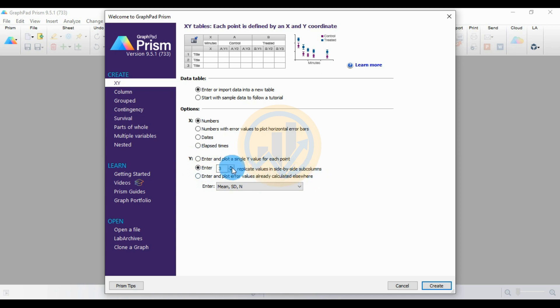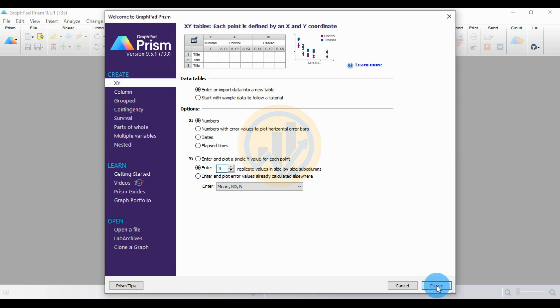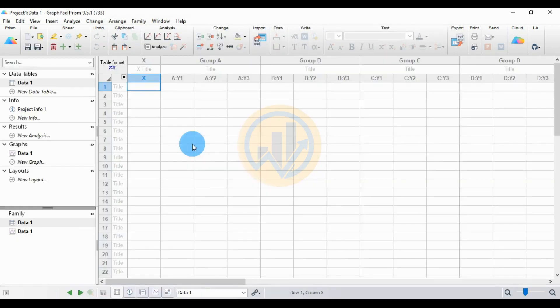If you want more replication times in the data analysis — 4 times, 5 times, or 6 times — use the arrow button to increase your replication count. I choose 3 times replication, entering the replication value as 3. Then click the Create button. The data columns open in GraphPad Prism software.